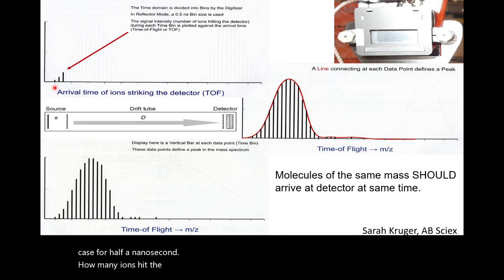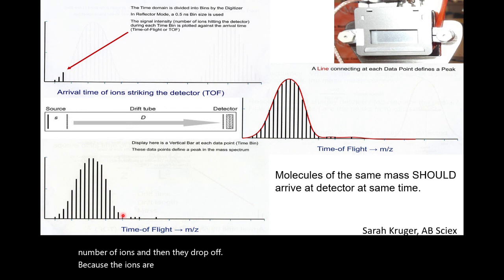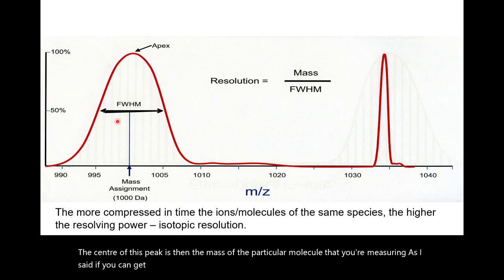And as the molecules of the same mass arrive at the detector, the number of ions in each bin gets larger and larger until you get the maximum number of ions, and then they drop off, because the ions are spread out slightly in time. They should all arrive at the detector at the same point in time, but they don't. If you then draw a line across this, the center of this peak is the mass of the particular molecule that you're measuring. As I said, if you can get all of the molecules of the same mass to occupy the least amount of space, you can create higher resolution.